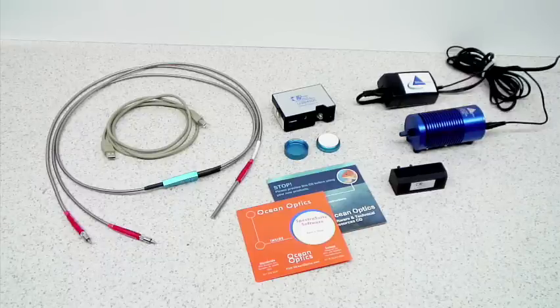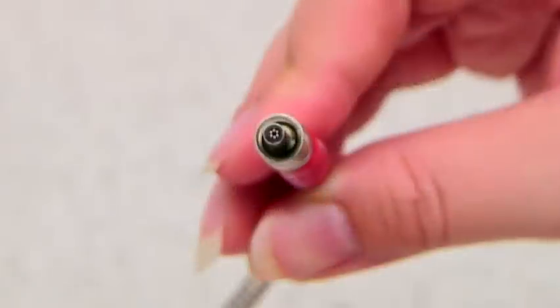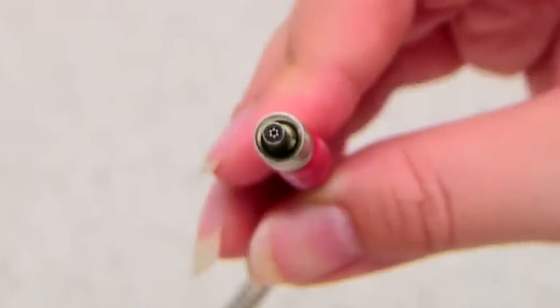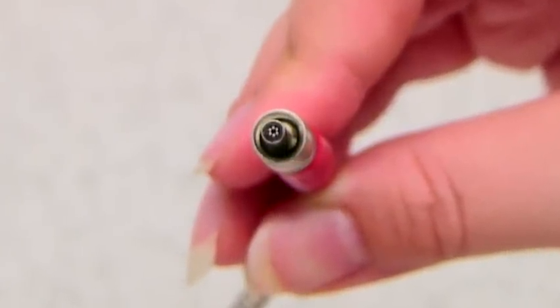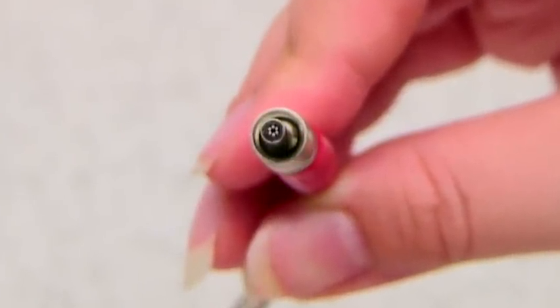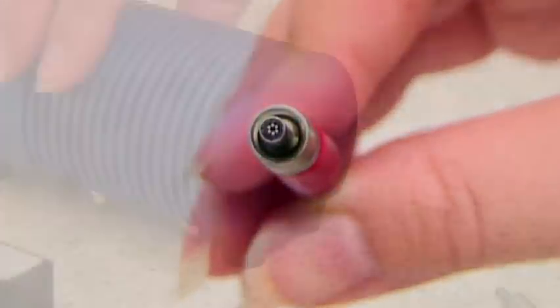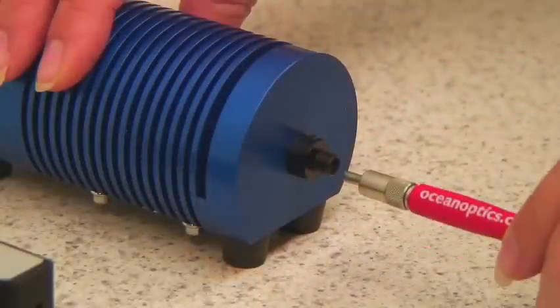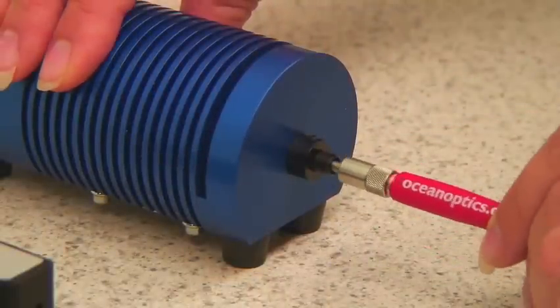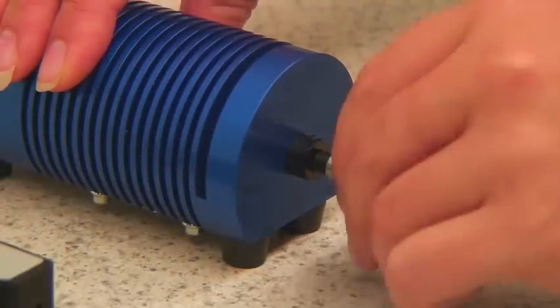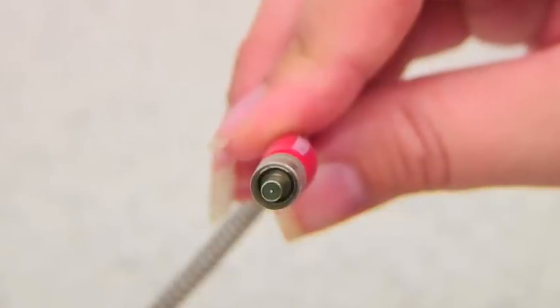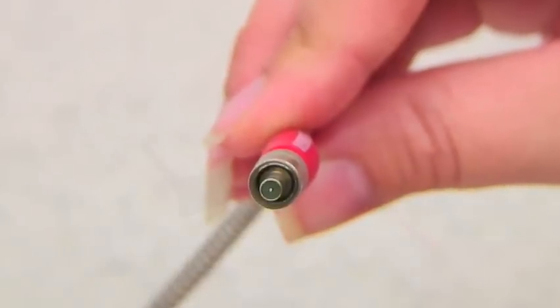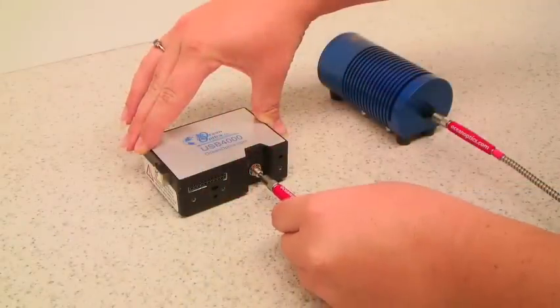It's important to connect each end of the reflection probe to the appropriate device. The SMA905 connector with the six illumination fibers should be connected to the light source. The SMA905 connector with the single-read fiber should be connected to the spectrometer.